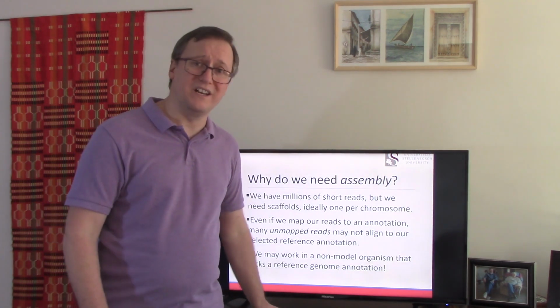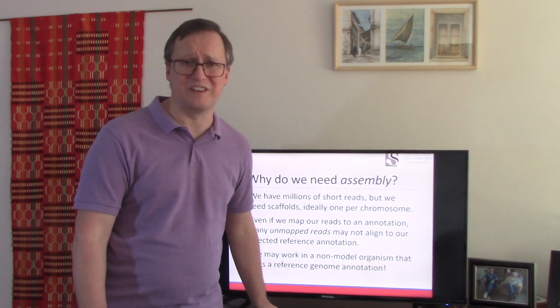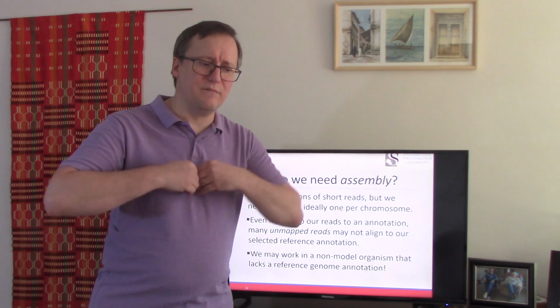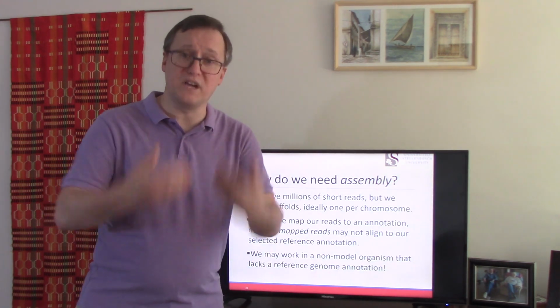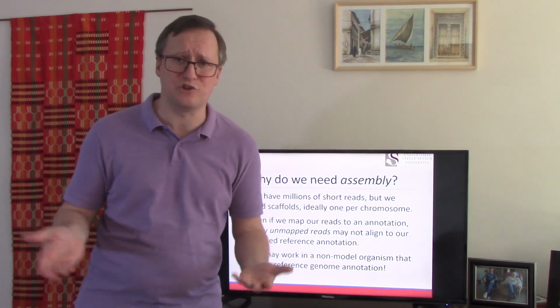We work, for example, in hyena. Because we're working in hyena, we are without a reference genome at this time. Maybe that'll change, you never know. But while we are trying to understand the sequencing data we can get from hyena, we must rely upon assembly rather than mapping because we don't have an annotation to work with.